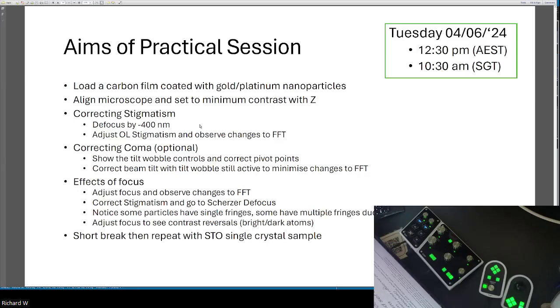We know it's pure gold that was sputtered by the SEM target. And we can use it for calibrating things like the diffraction camera lengths, but also the high resolution images. So it's a good sample to try and make and just have in your sample box, so you can do a quick calibration if needed. So that's what we're looking at today.